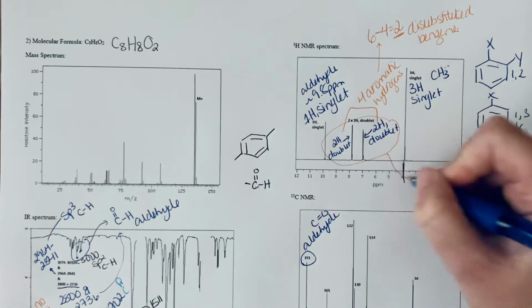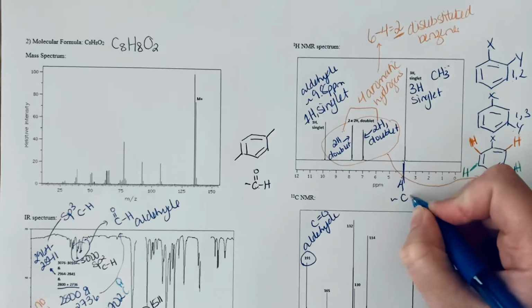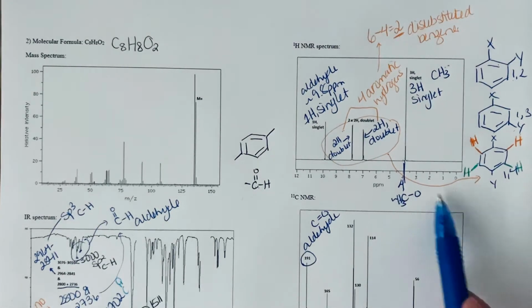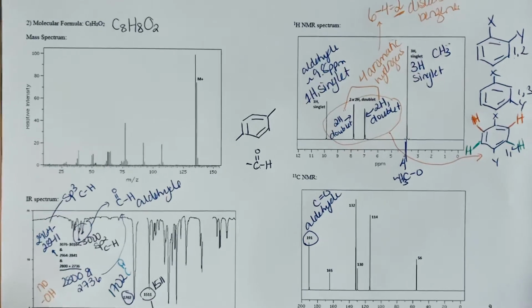And we can see that this chemical shift, that number there, is 4. So this looks like a carbon that's attached to an oxygen. So hydrogens that are attached to an oxygen. And so that would be an ether, right? Well, that makes sense. We were missing an oxygen.